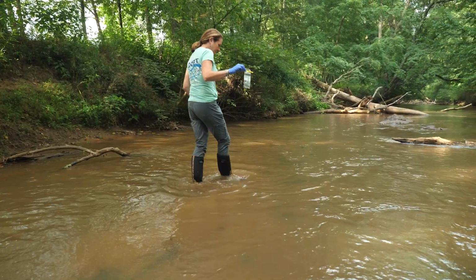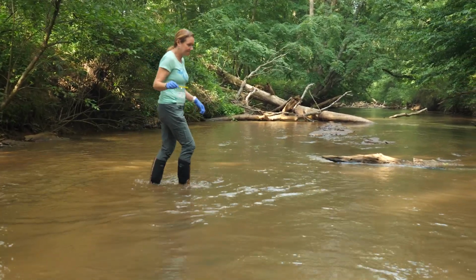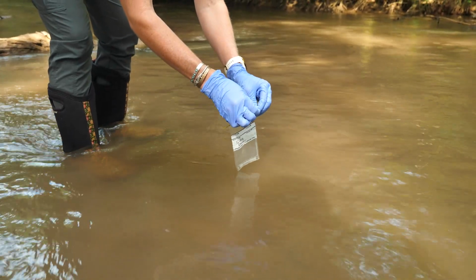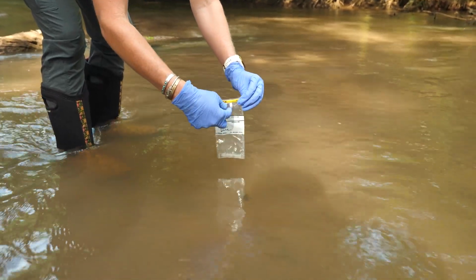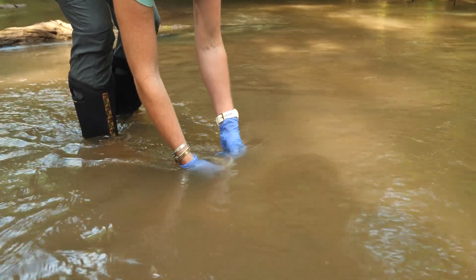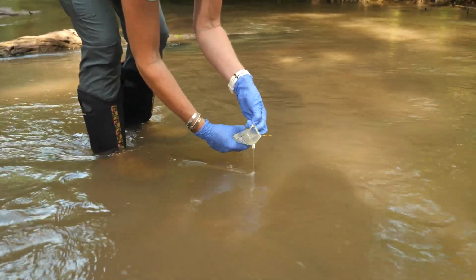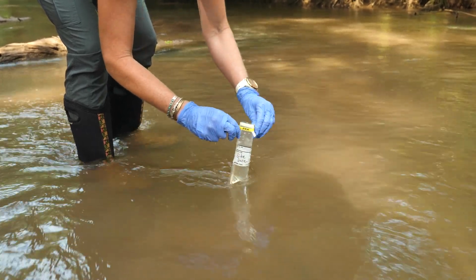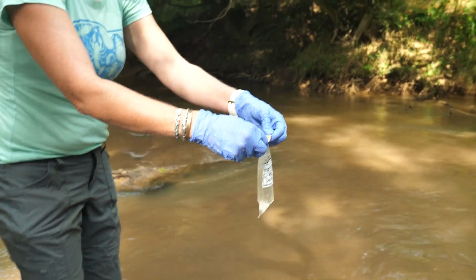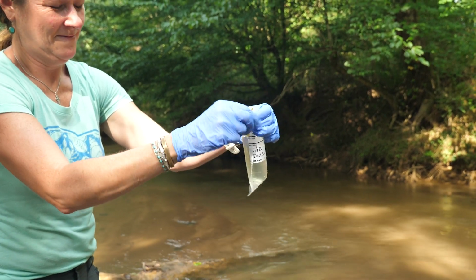Make sure to wear gloves and appropriate footwear. Choose a place in the middle of the stream that has flowing water. You'll collect the sample upstream from where you're standing. After removing the seal from the Whirlpack, open the bag underneath the water surface and fill it 2/3 full. Grab the twist ties and whirl the bag to create a firm seal. Twist the ties closed and squeeze the bag to check for leaks.